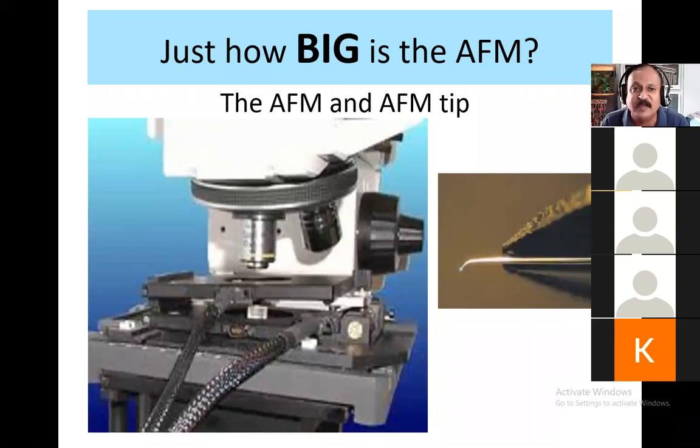the necessary software. Using that kind of software, you can allow the probe to go very, very close to the sample, to the exact place where you want it to go. And then you can start the scanning process so that the probe will now start scanning the surface on its own.